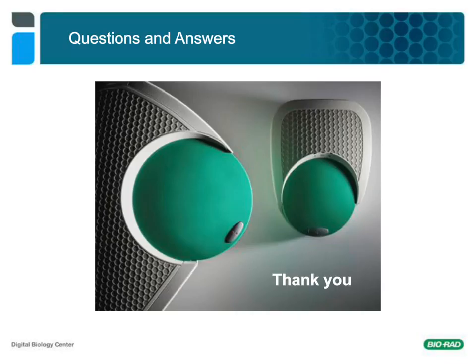Thank you very much. Our next question is, could it be feasible to apply ddPCR to detect circulating tumour DNA in plasma samples in a POC device? So can you apply ddPCR to detect it in a POC device?